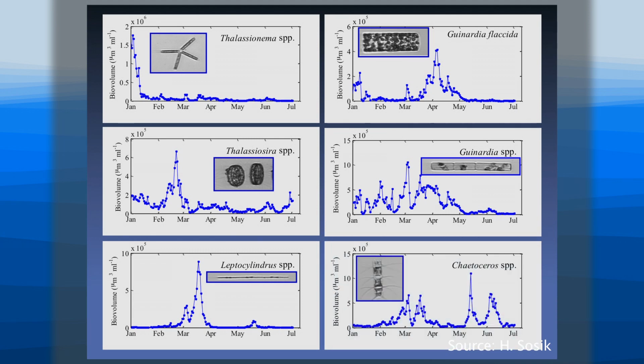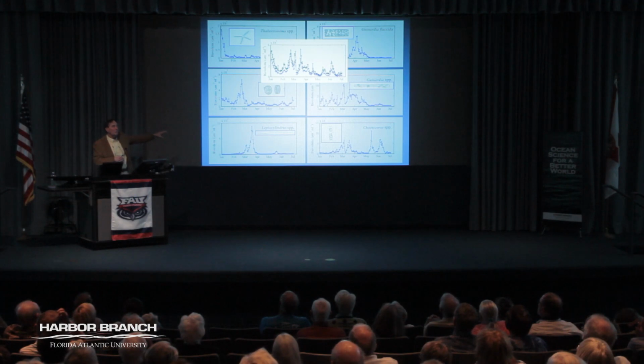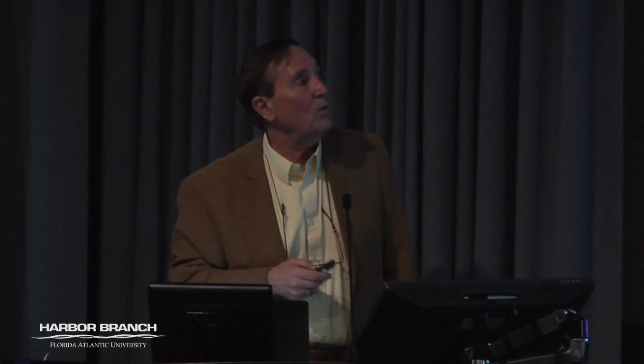That pattern that I showed you in the beginning is really the result of all of these different species that are called. And this instrument sitting out there unattended for 6 months, sending all this information back to someone's computer at the lab, everything's being done. It's an incredible way to monitor. And this is what I've been telling people here, that I think you should have some of these in the Indian River. It's a great way, and this is where I'm looking at how maybe we can help make that happen.